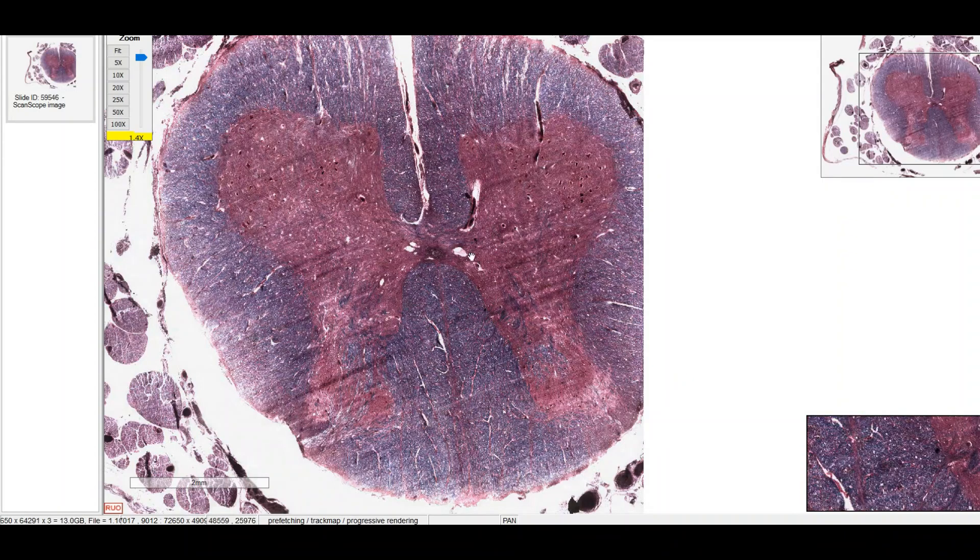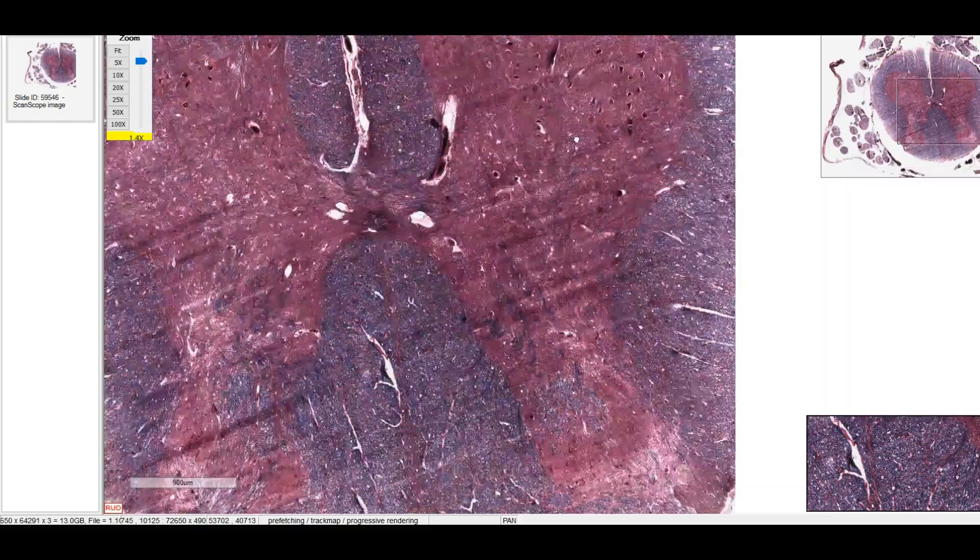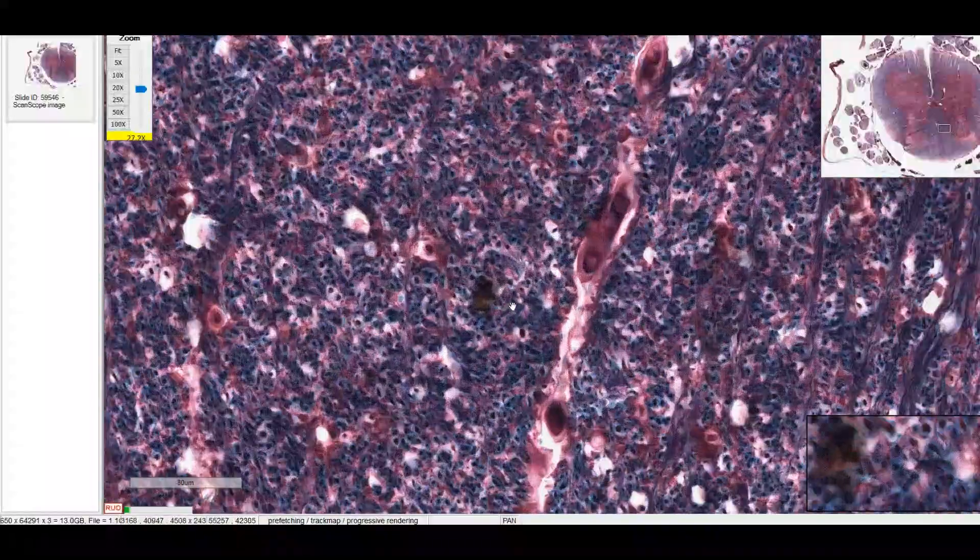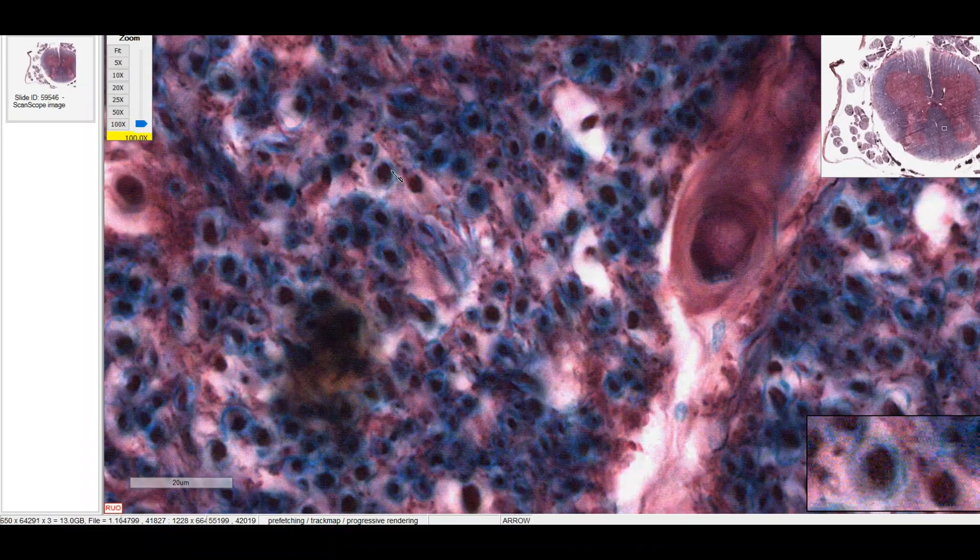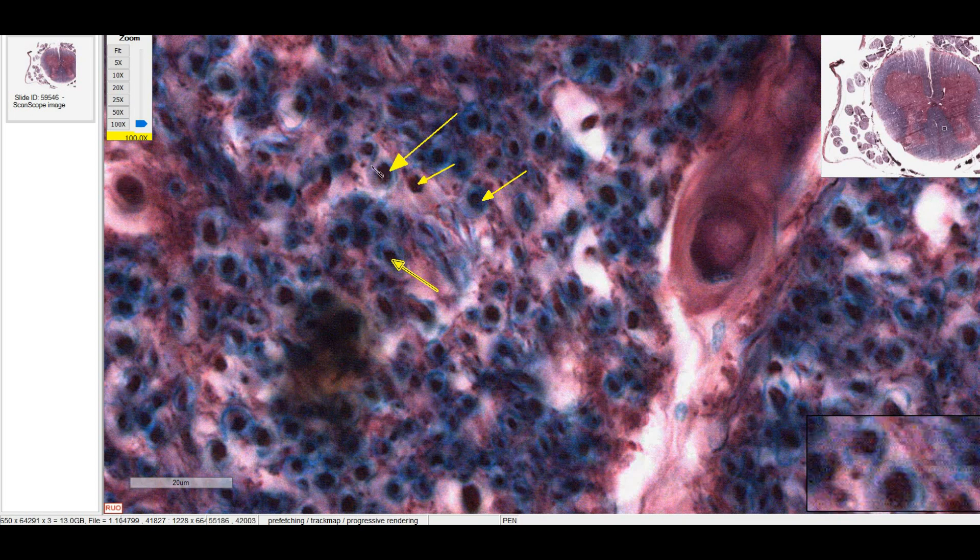This slide uses different stains. You can see the neuropil is pinkish. And if we zoom into the white matter, the myelin here is actually better preserved. So you can see these are the axons, these dark circles. And you can better see the myelin surrounding each of the axons.